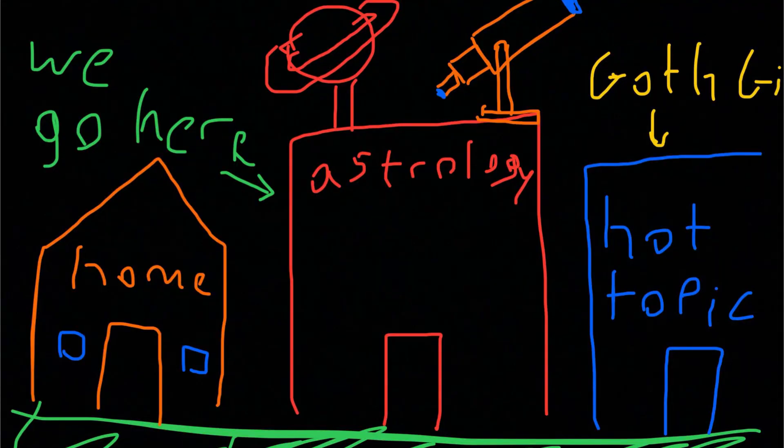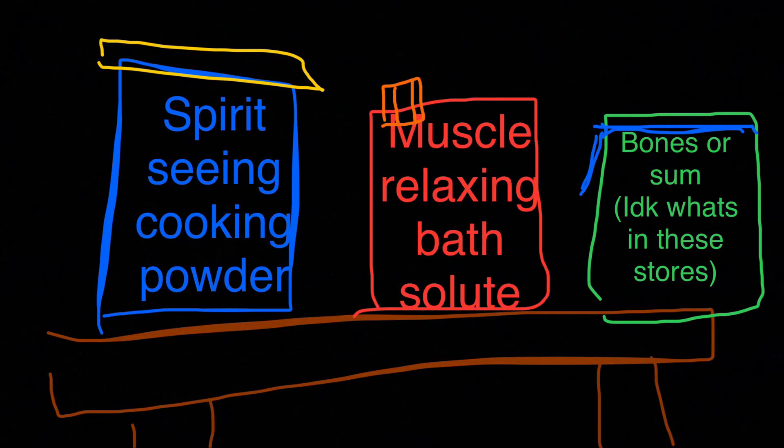So to begin this forbidden cook show, we venture out of the house to the local astrology store or something, because ain't no way anyone sane would believe that stuff actually works. And we come back with Epsom salt.